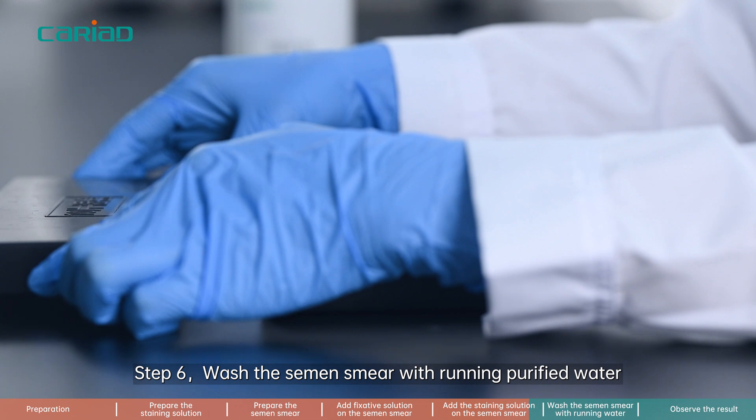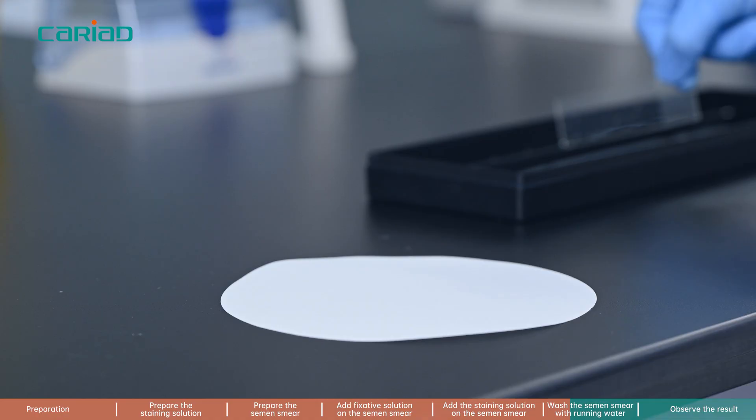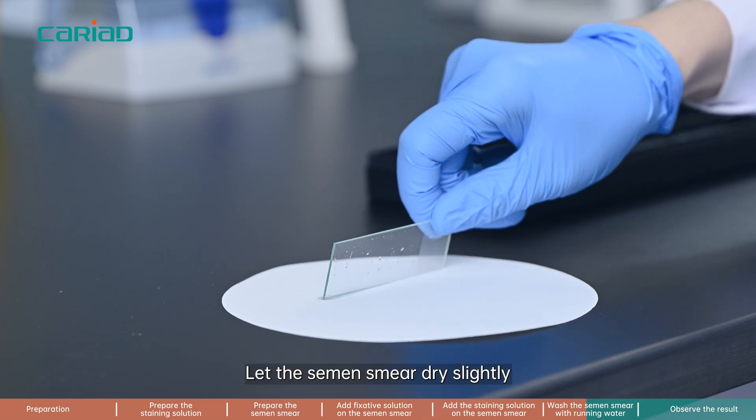Step 6. Wash the semen smear with running purified water. Let the semen smear dry slightly.